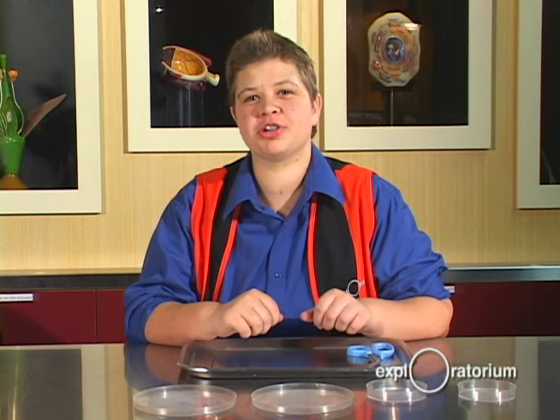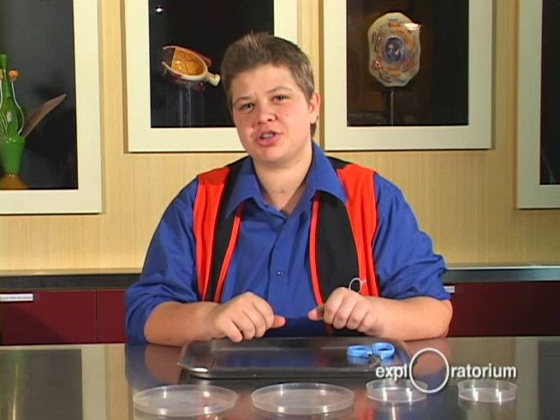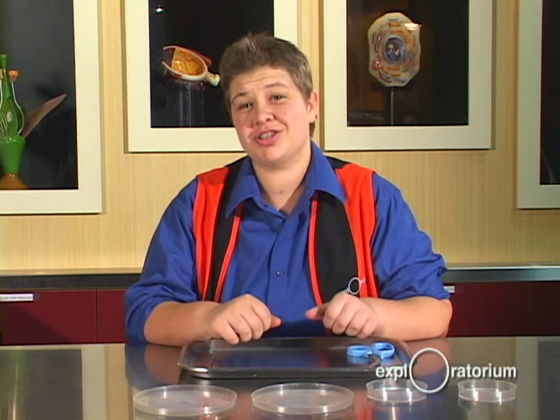Hi, my name is Katie Fleming. I'm an explainer at the Exploratorium and I've worked here for about three years. We do cow eye dissections and we get our eyes from local meat distributors. I've probably conducted a cow eye dissection four times a week for the last three years, so that's a lot of eyes.